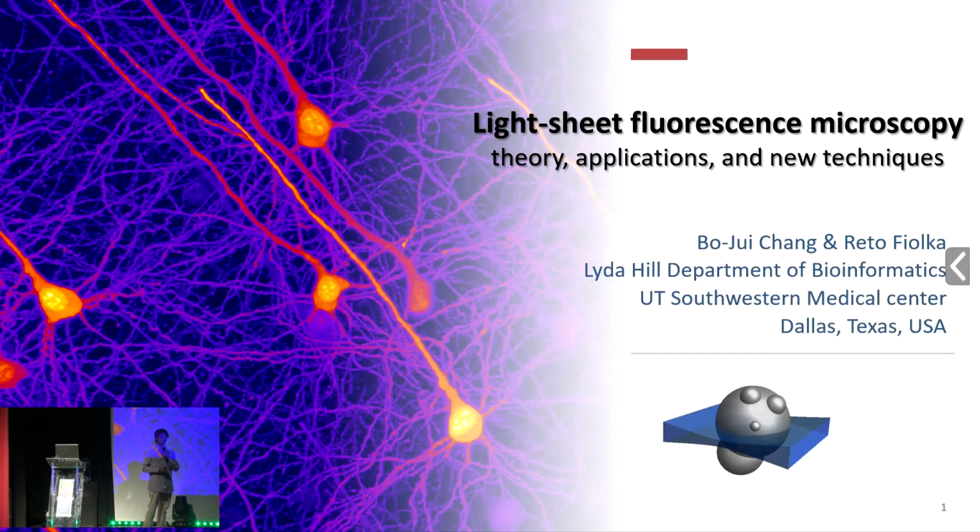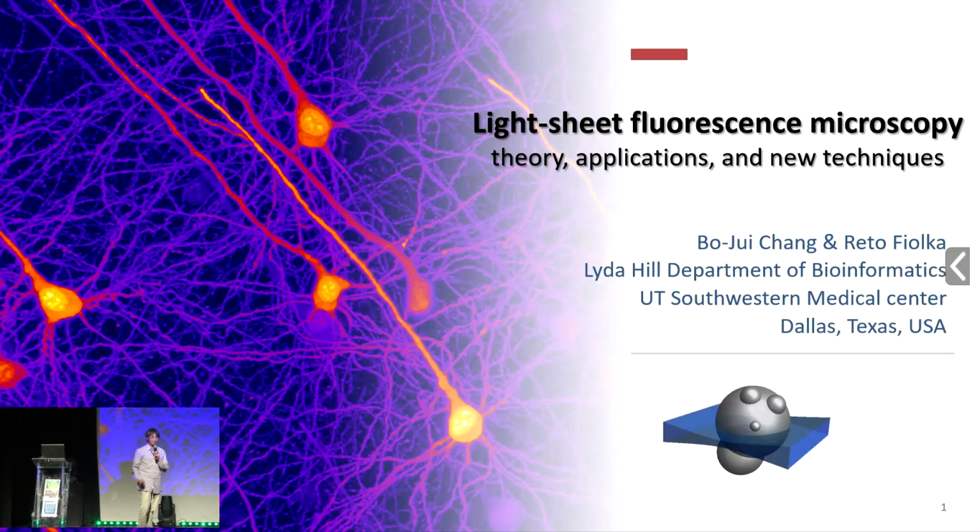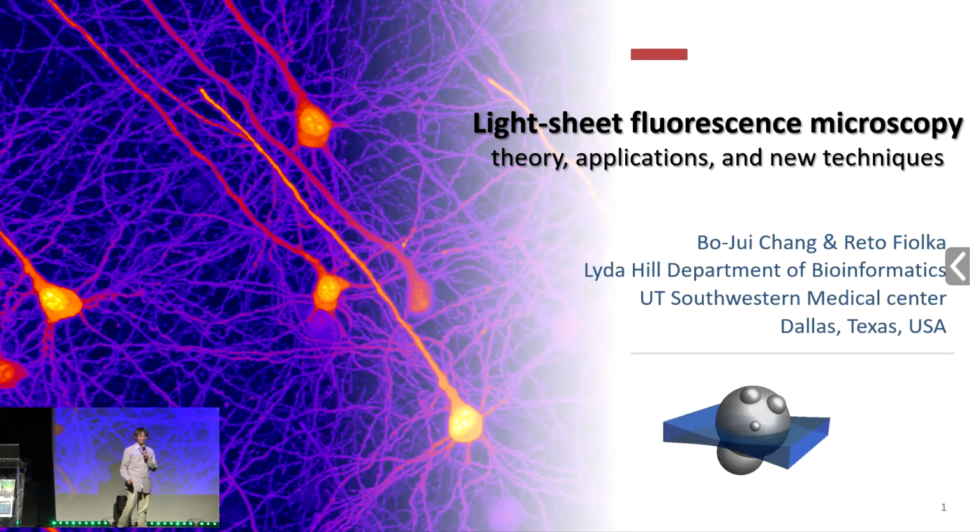So before I start, I want to ask, who has ever heard of light sheet microscopy? And who has ever heard of oblique plane microscopy, OPM? Structured illumination microscopy? Wow. And a combination of OPM and SIM, or light sheet and SIM? Good.